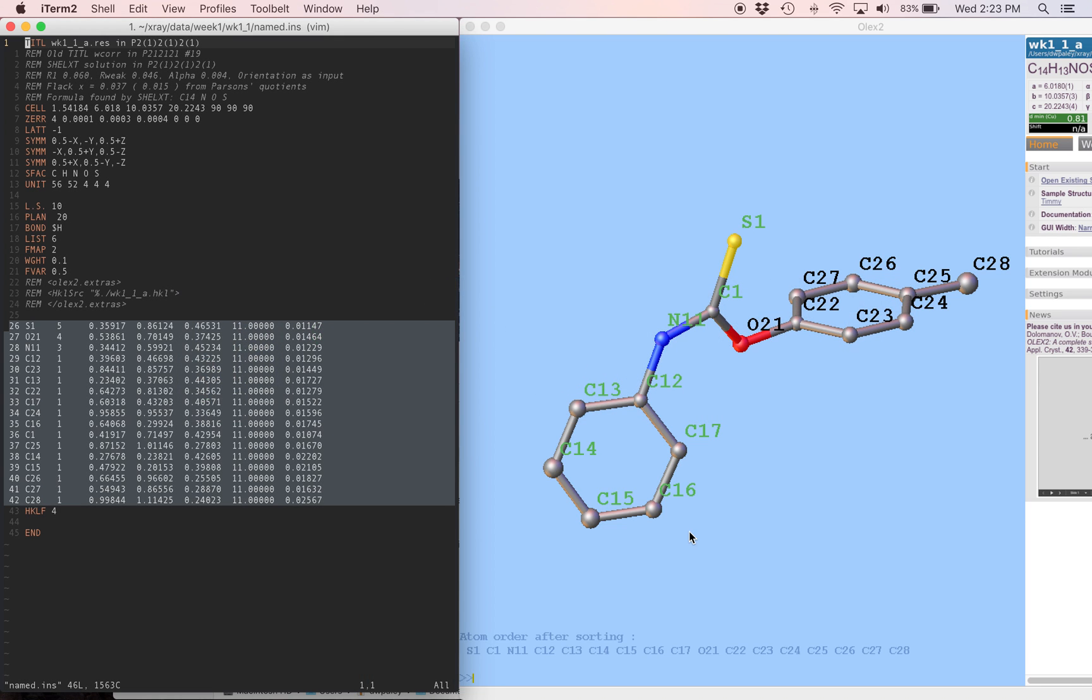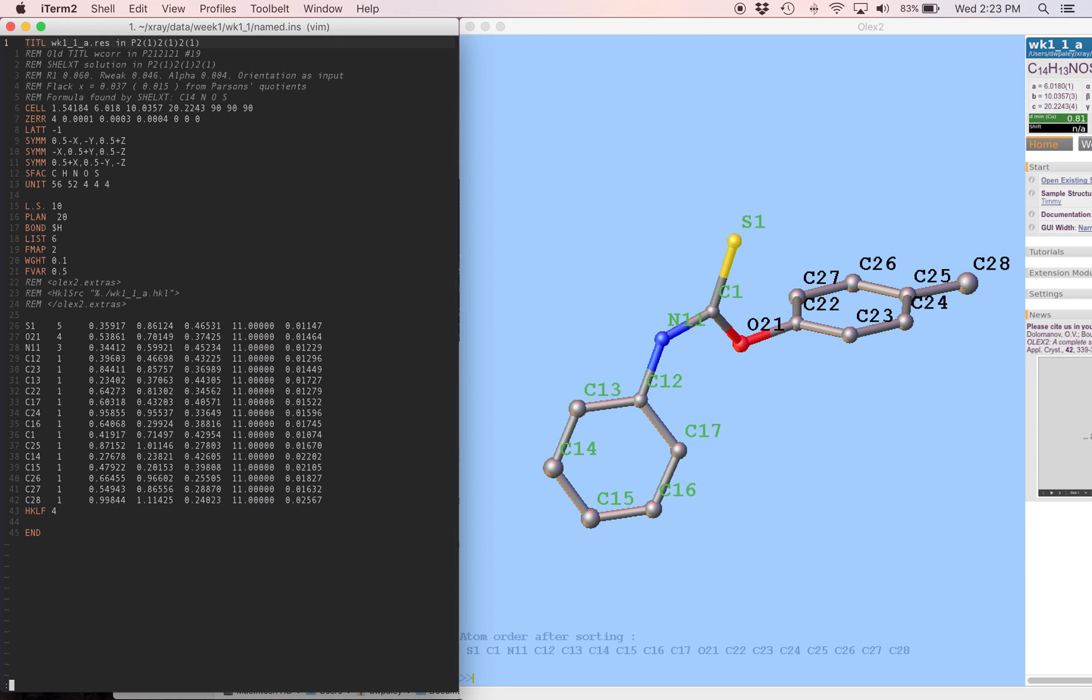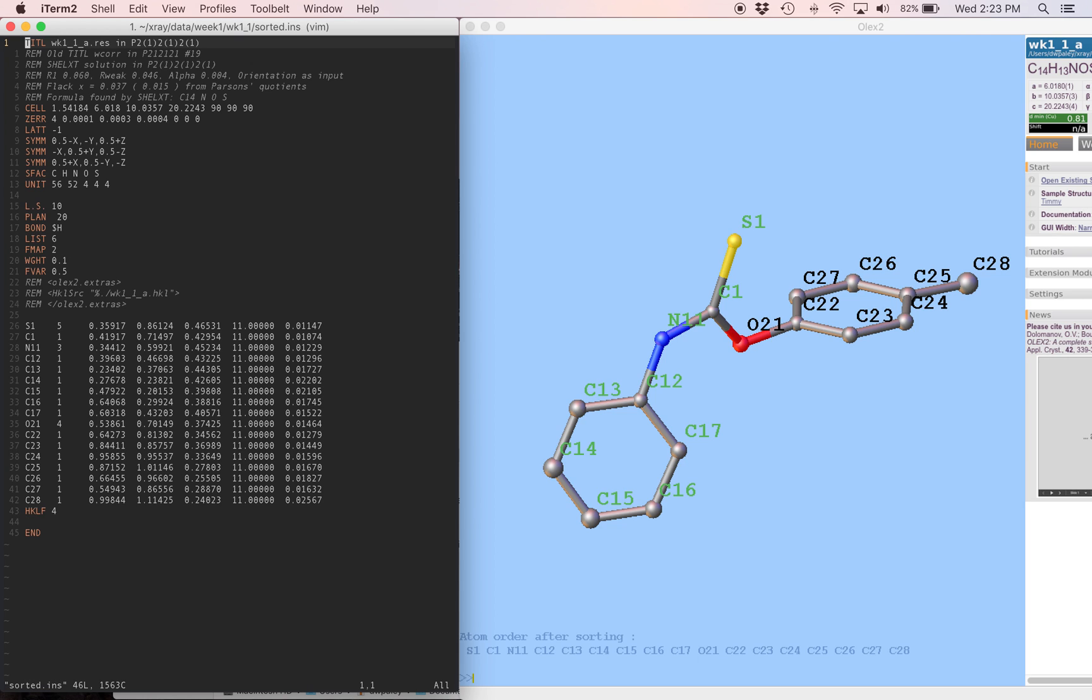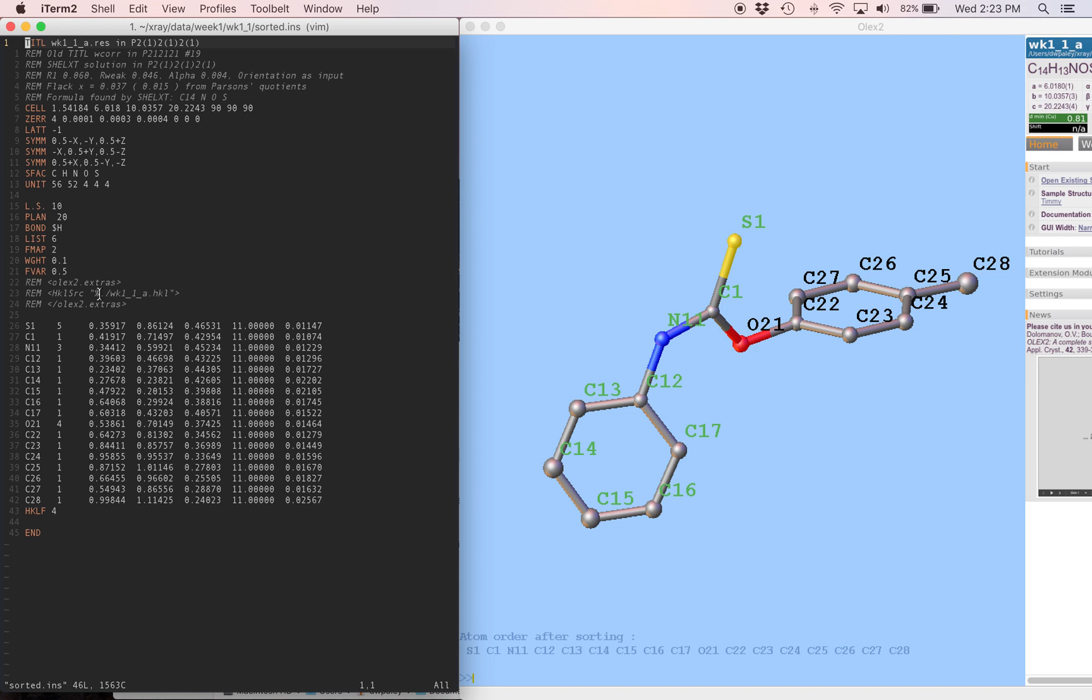Now we can come back over here. Edit sorted.ins. And everything is in order. So this looks good. We have our least squares instruction. We have a few other things that Olex added, and it's pretty close to what we want.